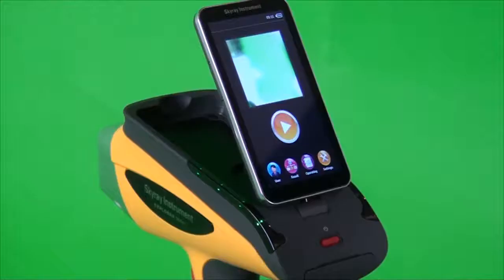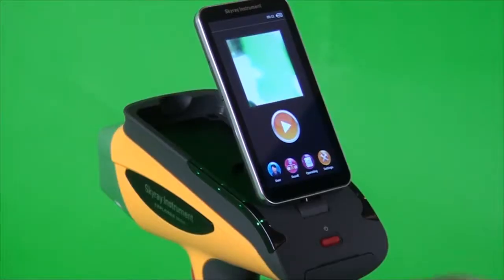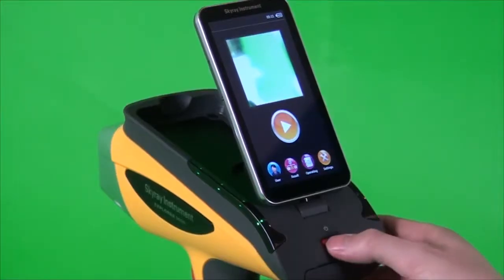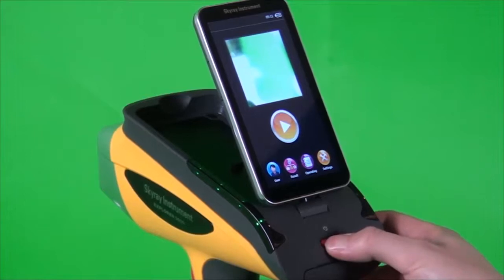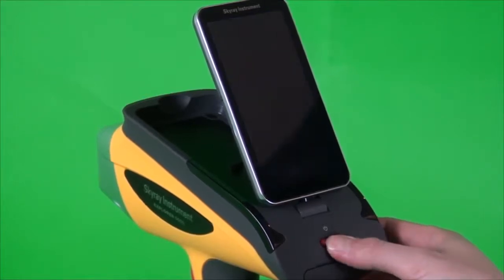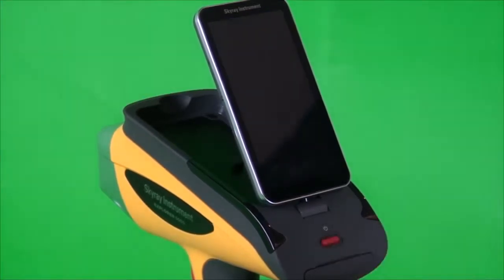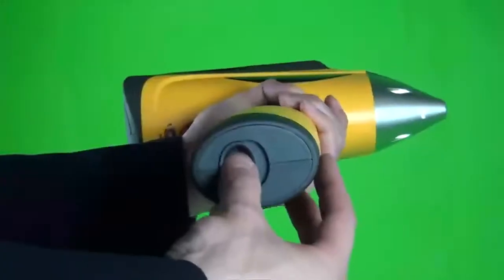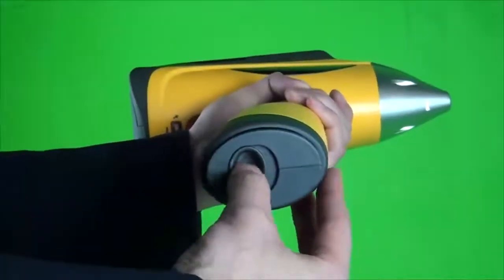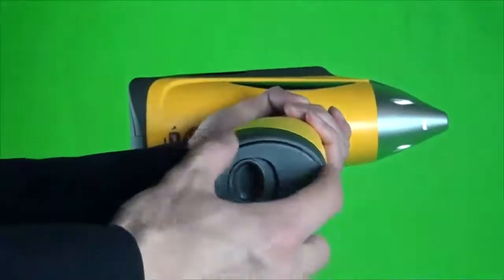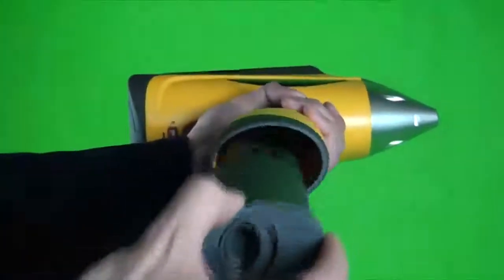Third, Shut Down: In normal activation of instrument, keep pressing the Switch button over 3 seconds, and the instrument will be automatically shut down. Finally, remove the batteries and pack up the instrument.